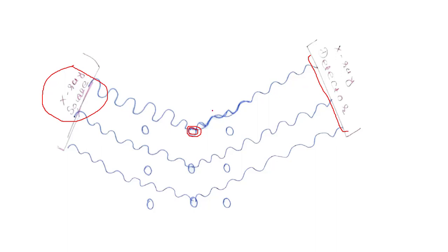So we can say that this is the position of the atoms, and even for the same wavelength, we cannot achieve this for all atoms. So we continuously change the angle of the X-ray, and we find the positions of all atoms, or the distance between all atoms.